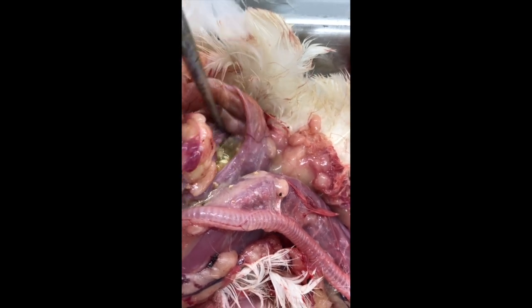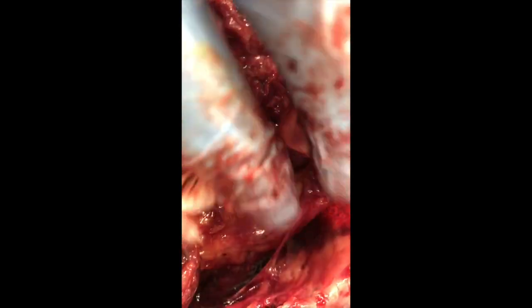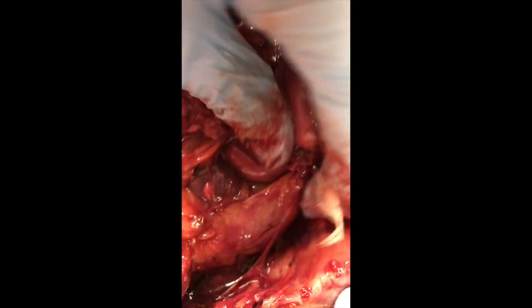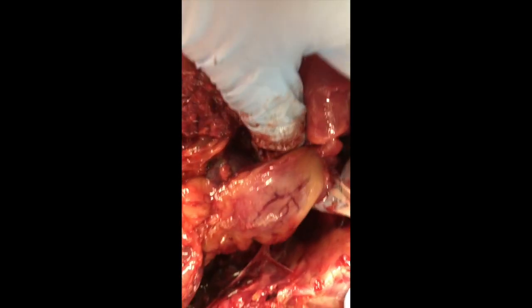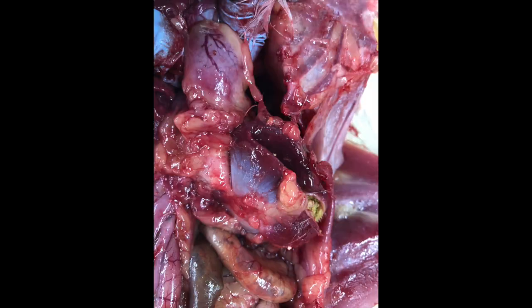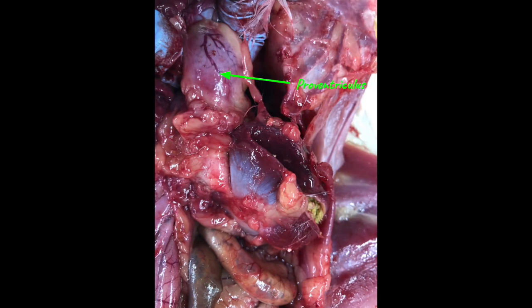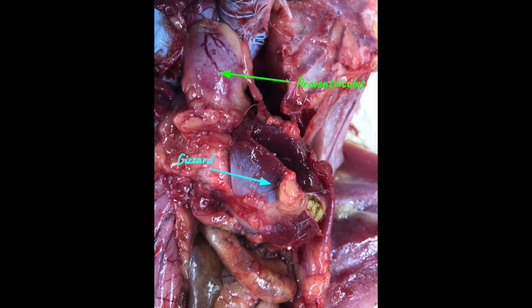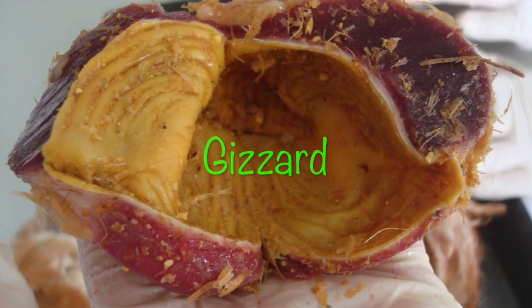From the esophagus, food enters the crop — a muscular pouch where food is temporarily stored before digestion. If you look inside the crop, you can see this food. From the crop, food continues through the esophagus to the proventriculus, which is the glandular stomach of a chicken.